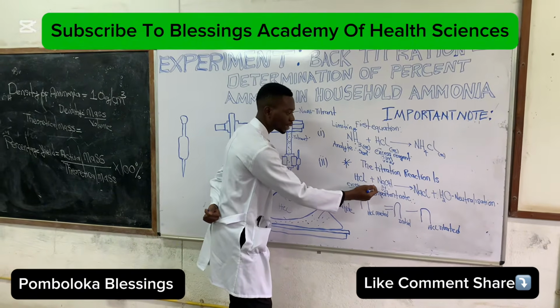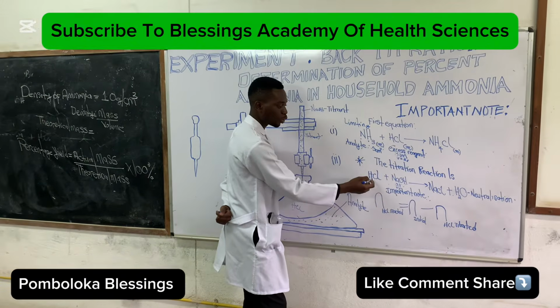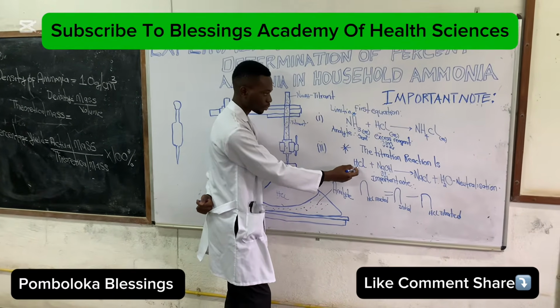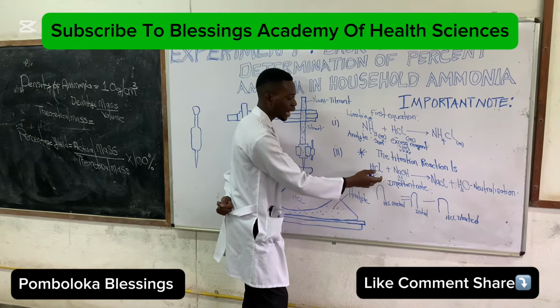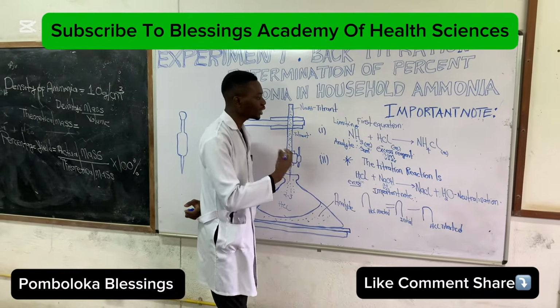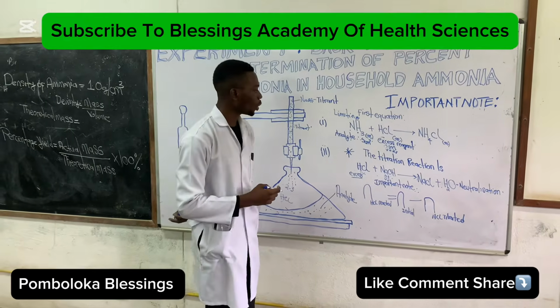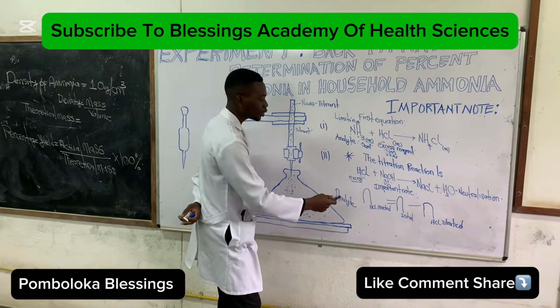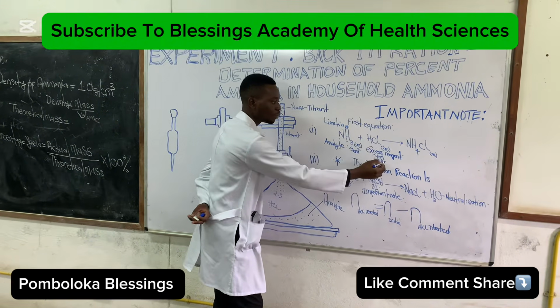So now by doing this, you know the mole ratio here is 1:1. You can find out the moles of the HCl. When you find the moles of the HCl, those are the moles that appear in excess. So now to find the moles of the ammonia that reacted in the first part of the equation, what we're going to do is subtract from the moles that we had here initially, because the volume was given.